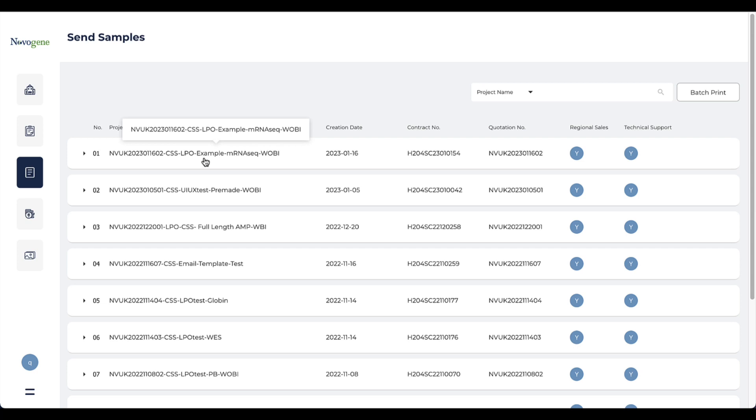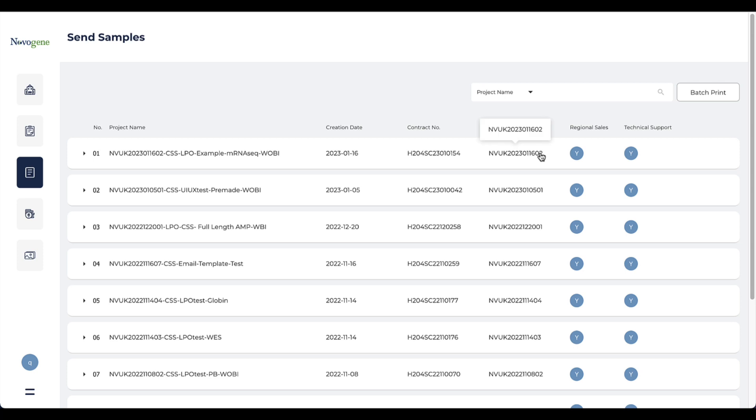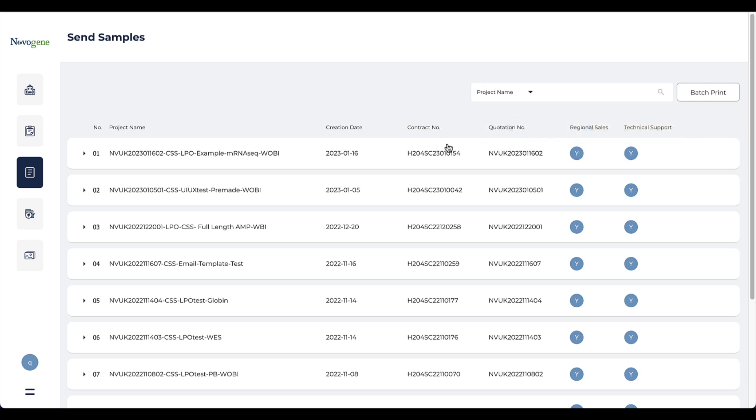First, you need to find the project that you want to send samples. The project bar includes basic information such as quotation number and contact details for your account manager and technical support. Please do not hesitate to contact them if you have any issues when uploading the information or need any help.